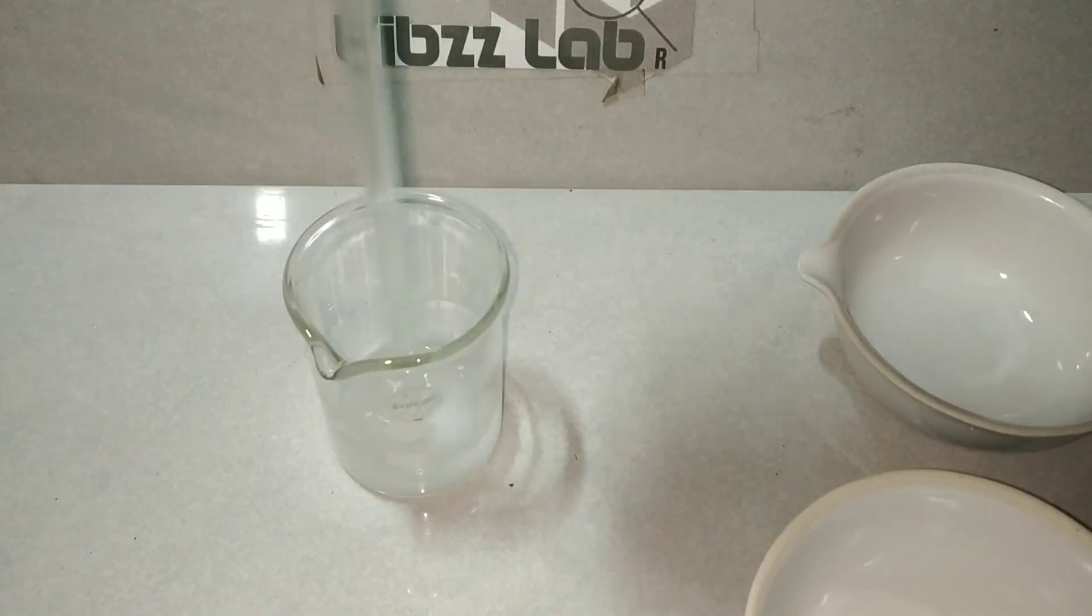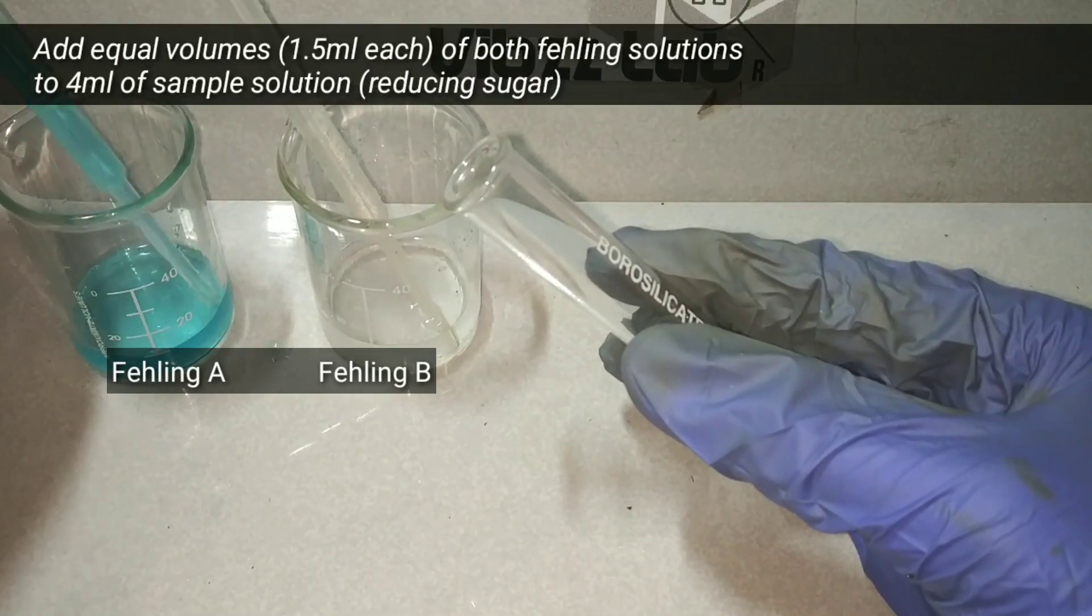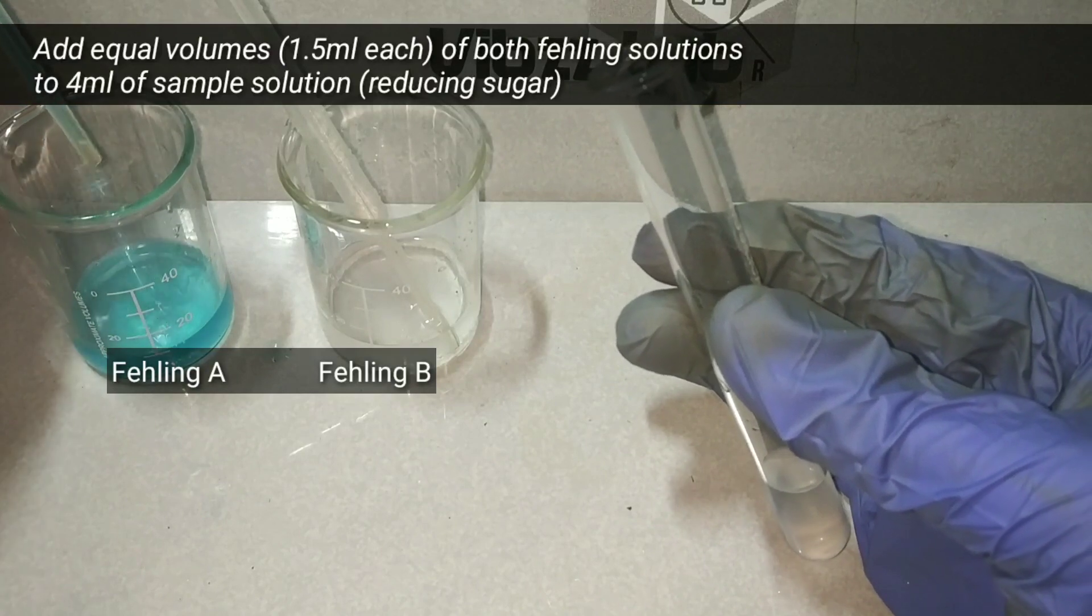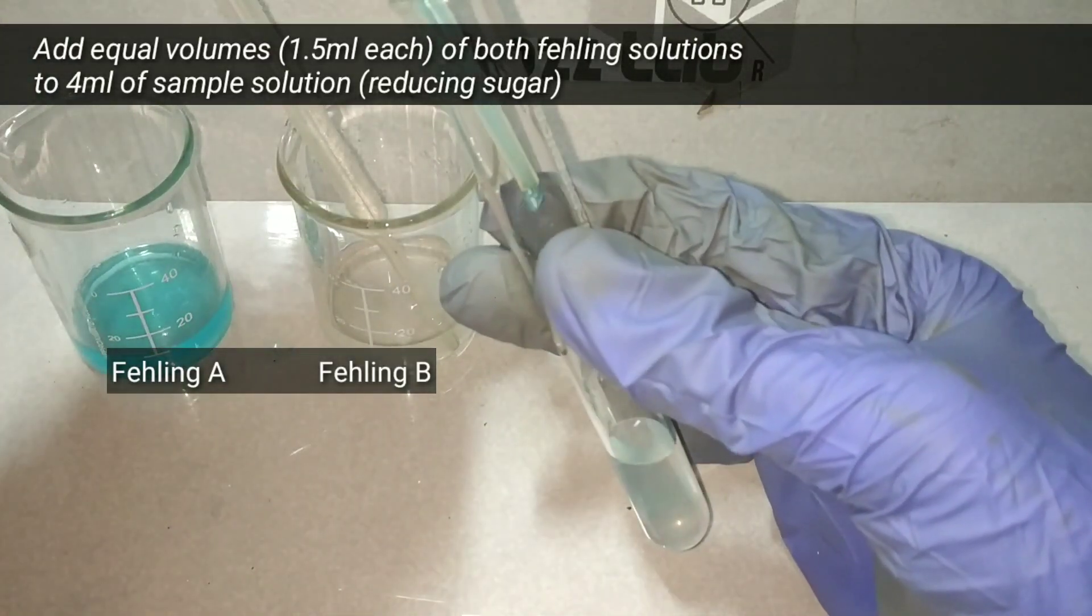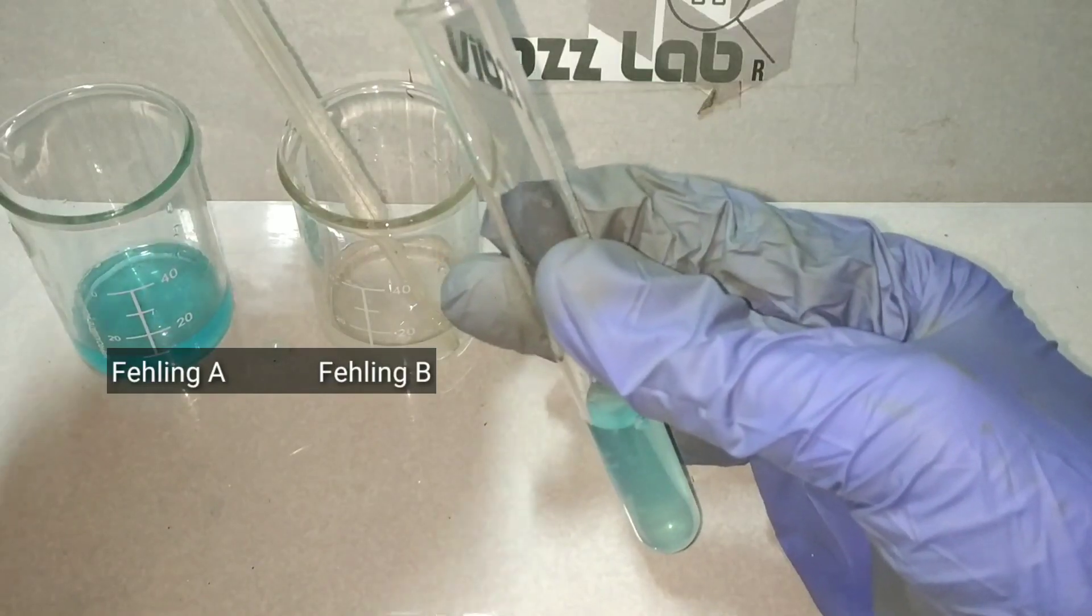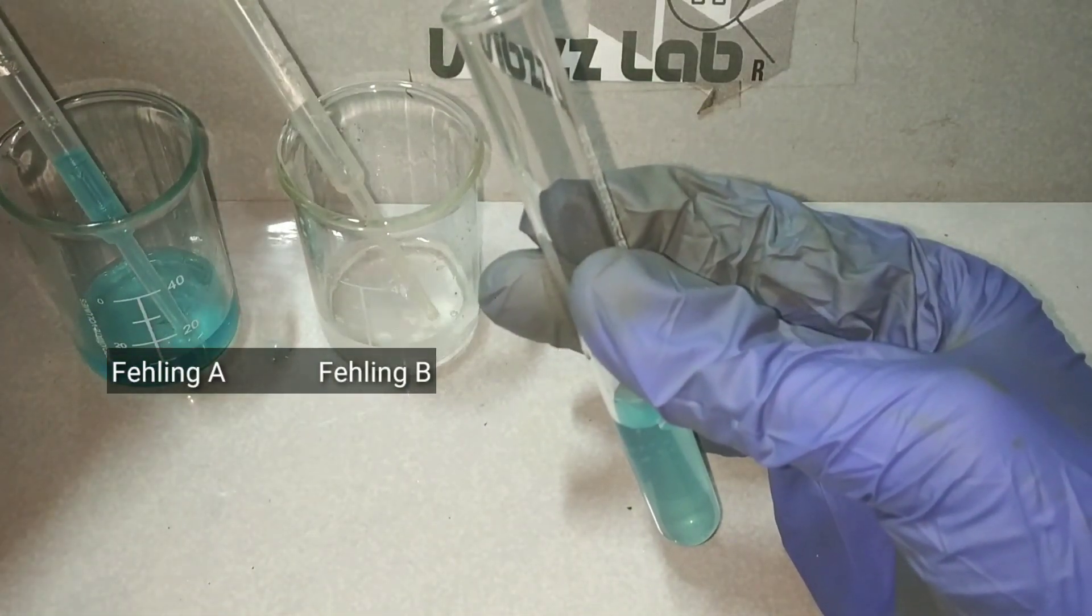After mixing the solution well, we have the Fehling reagent B. Now let us do the Fehling test. We have taken 4 ml of the sample solution, which is a reducing sugar, in a test tube and we add equal volumes of both Fehling reagent A and B into it. I am using 1.5 ml of the reagent.